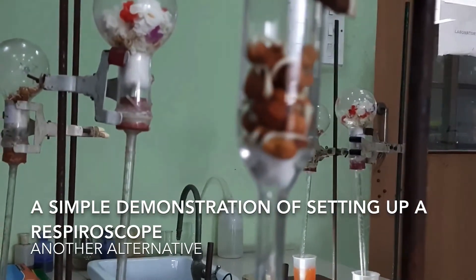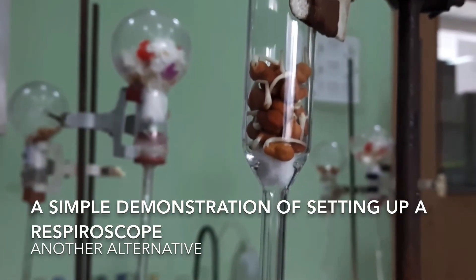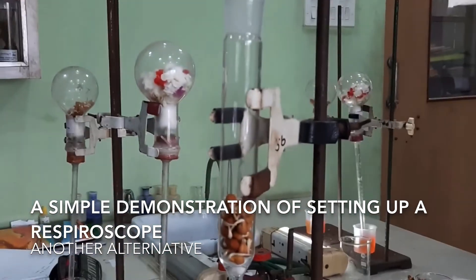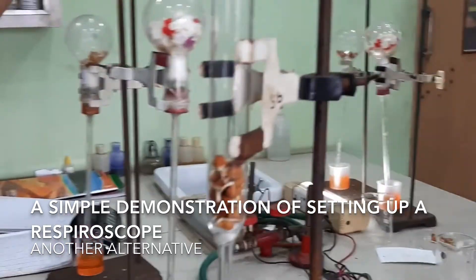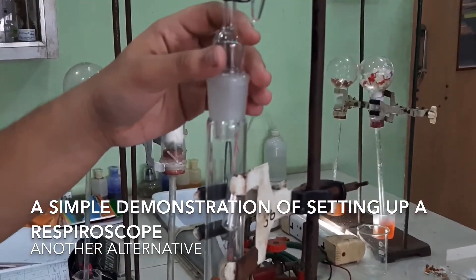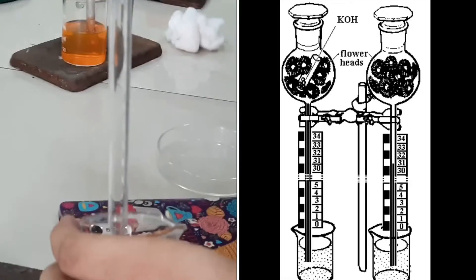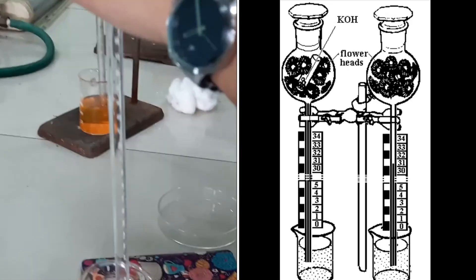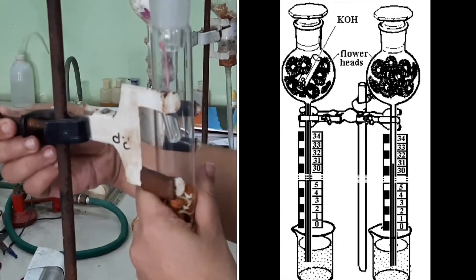There is also an alternative apparatus which can be used to perform the same experiment — it is called a respiroscope. We will do a simple demonstration of the entire setting up of the apparatus. The same principle applies: with respiration there will be a suction pressure which will increase the level of brine water. We have kept the diagram here to compare the entire setup.